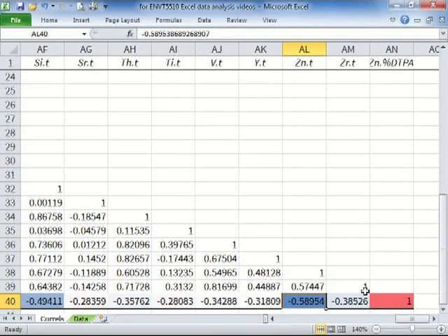And so we'd expect to see a positive relationship in that case between total zinc, total metal, and the amount extracted by DTPA. And we see the opposite in this case, suggesting that possibly the zinc is held in different ways, maybe in the structure of minerals, and that may become more pronounced, we're guessing here of course, the more zinc we have in the soil.